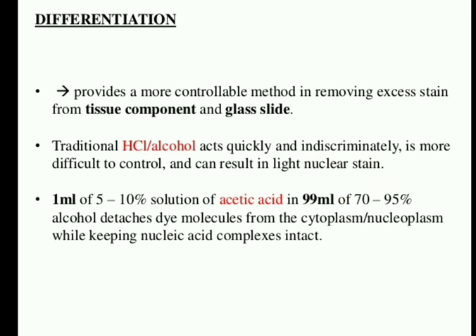Differentiation provides a more controllable method of removing excess stain from a tissue component and a glass slide. 1 ml of 5 to 10% acetic acid in 99 ml of 70 to 95% alcohol detaches dye molecules from cytoplasm and nucleoplasm while keeping the nucleic acid complex intact.